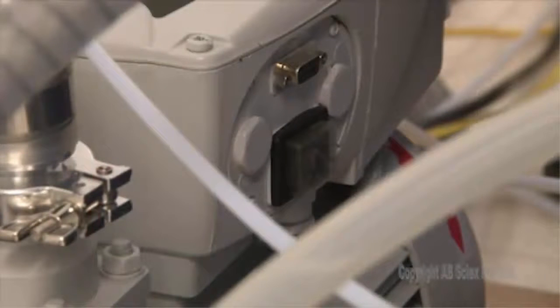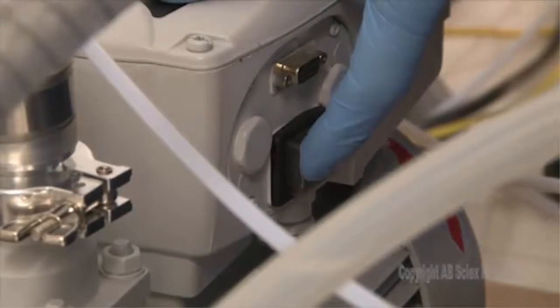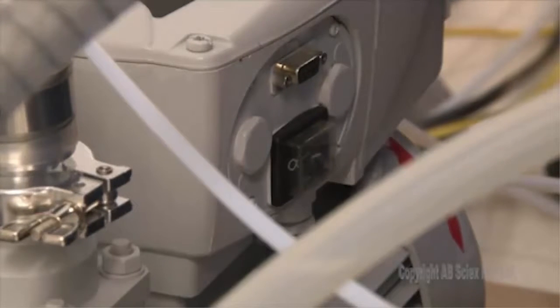On the 4500 series of instruments, the roughing pump must be turned off by hand. The location of the roughing pump power switch may differ per model. For more information, refer to the roughing pump documentation.